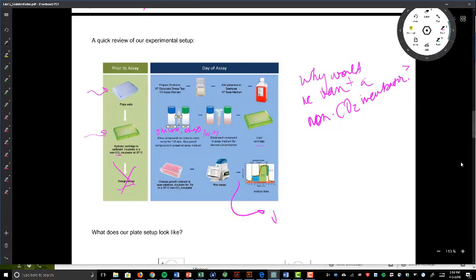We'll wait for an hour. That's when you'll do your extra credit presentations. And then we'll run upstairs. I'll pull the data off the Seahorse with my flash drive. I'll post the data to the Google Classroom website, and then you'll analyze it.